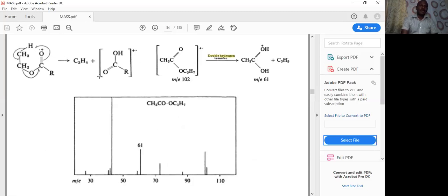And then you have the C2H4. Here you can see what you have, CH3 and CH2.